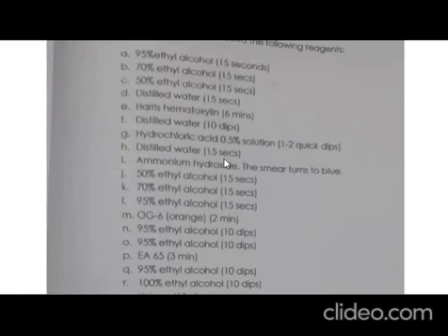And then after distilled water, we proceed with our bluing agent. So meron din pong bluing agent, si classical method. So the bluing agent here is ammonium hydroxide. Okay? So, what is the purpose of the bluing agent here? Now, what is the purpose of ammonium hydroxide? The purpose of ammonium hydroxide here, class, is to subject our hematoxylin in alkaline condition.